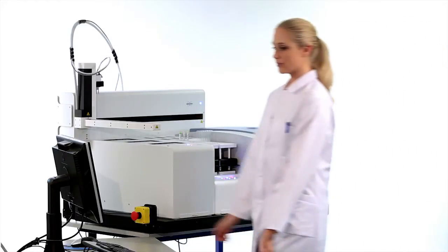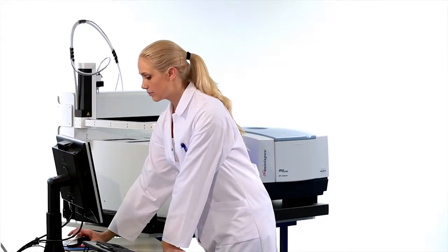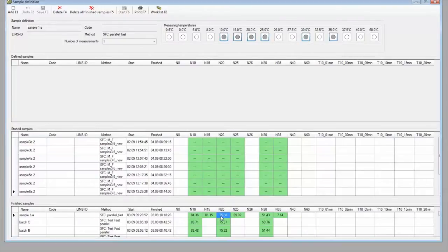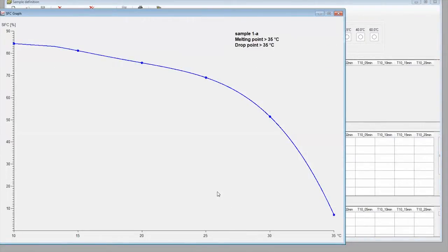After successful NMR measurement, an overview of the results is displayed. Additionally, the melting curve is plotted and estimates of drop point and melting point are calculated.